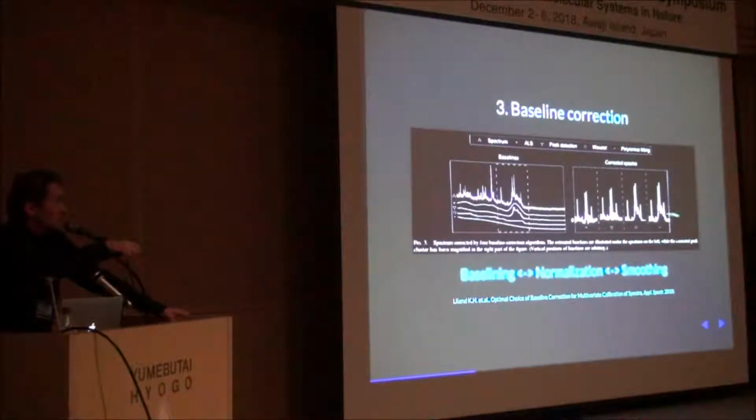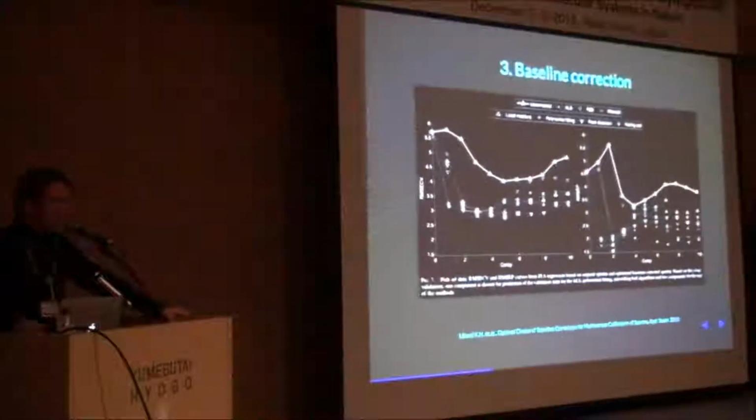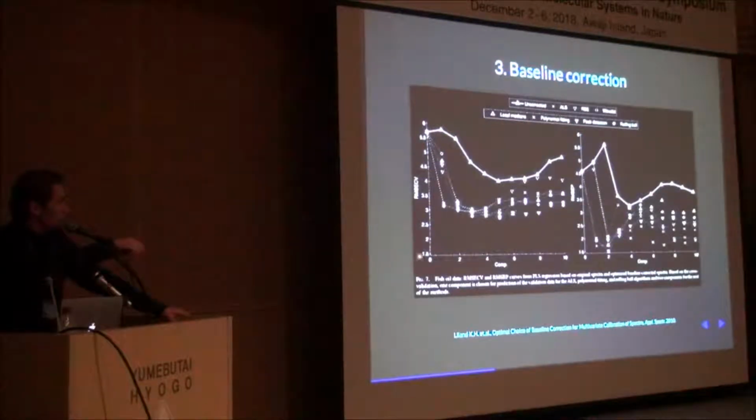So here we have the outcome of the pre-processing methods, and then they're compared. And I think as it usually comes, you get a graph like this. You get a number of principal components, and you get the prediction accuracy of the model and the prediction accuracy of the new samples. You can see that it's somewhere around the second or third principal component, and here around the fourth principal component. The black line is data that is not processed, and all these dotted lines are processed. I'm sorry for the poor quality of the picture, but in the publication, in the PDF file that I'm supplying, you will get a much better view of that.